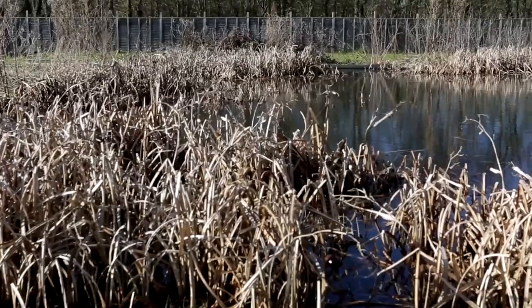Hi, I'm Jo, an ecologist from ADAS and today I'm going to talk to you about Great Crested Newts, one of our seven UK native amphibians which are protected under European legislation. I'm going to talk you through how to do an eDNA water sample as part of a Great Crested Newt survey.